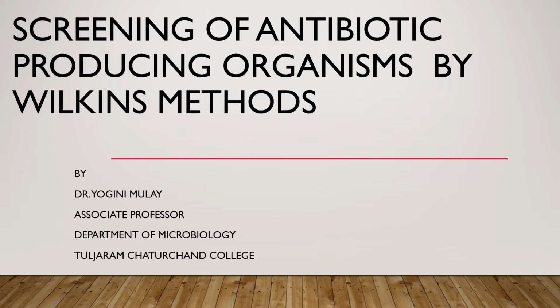Hello everyone. In this lecture, I will be talking about the screening of antibiotic producing organisms by Wilkins method.